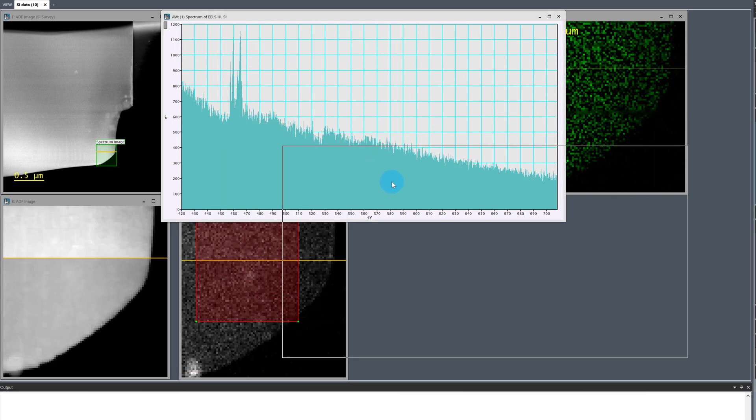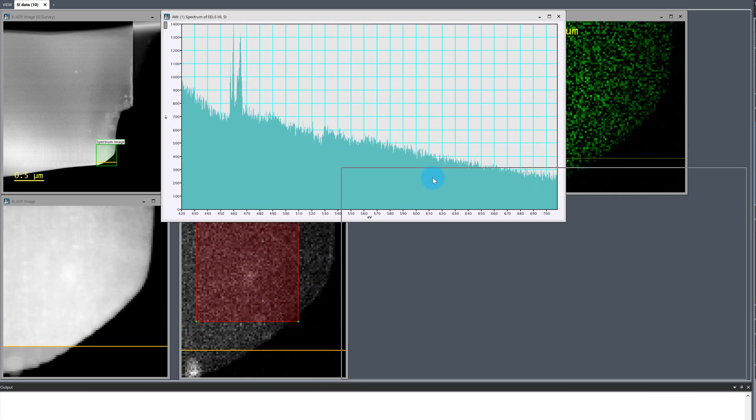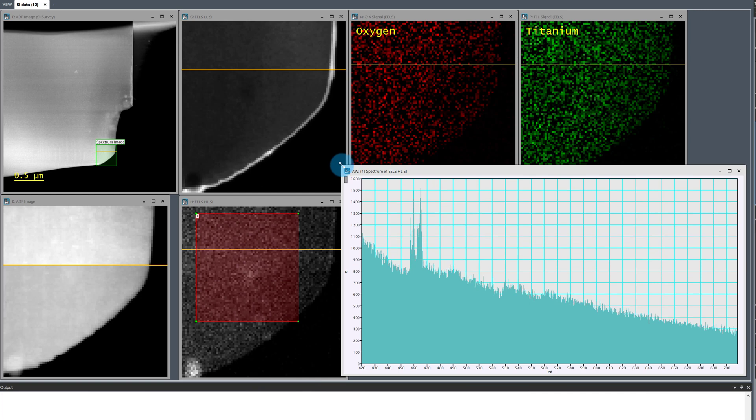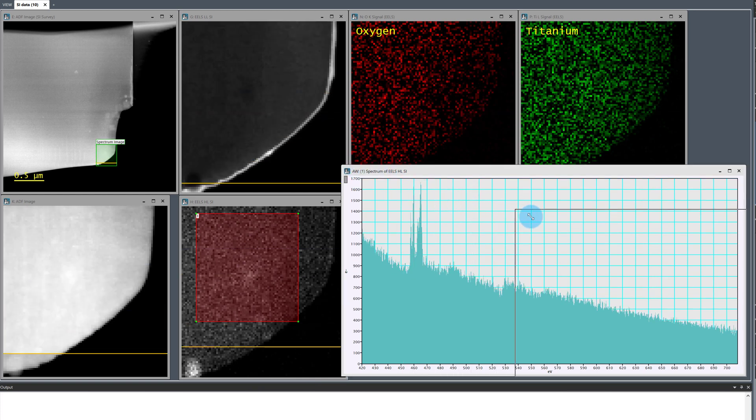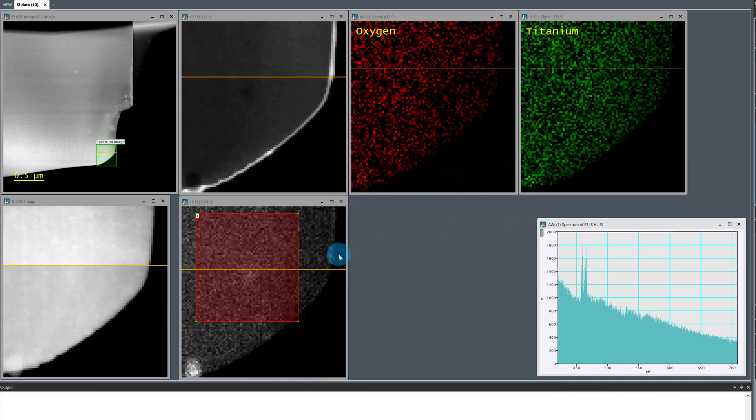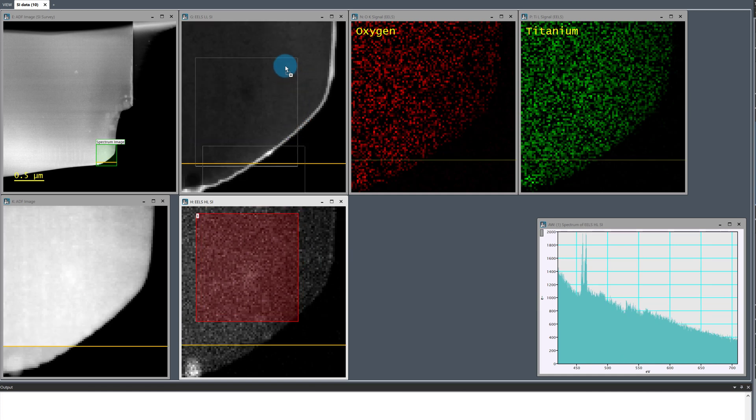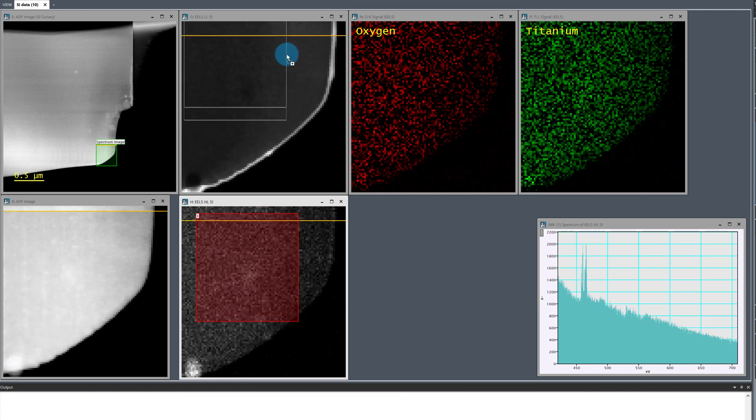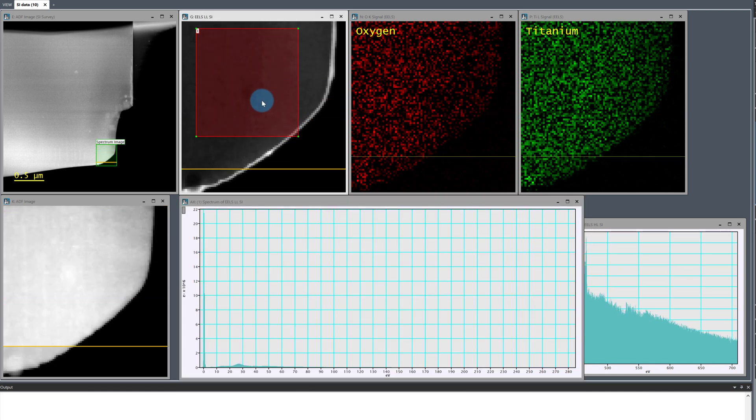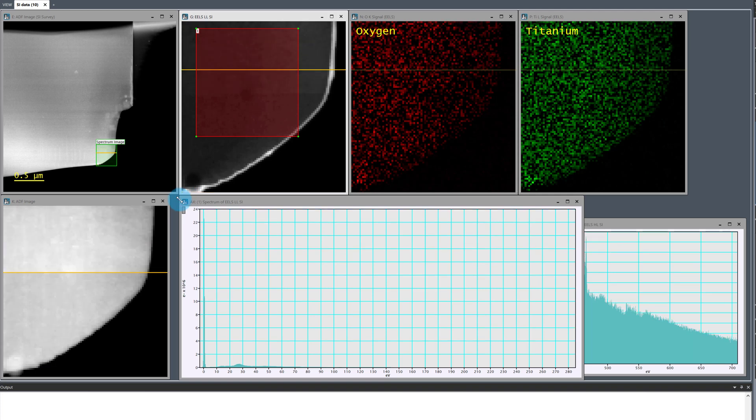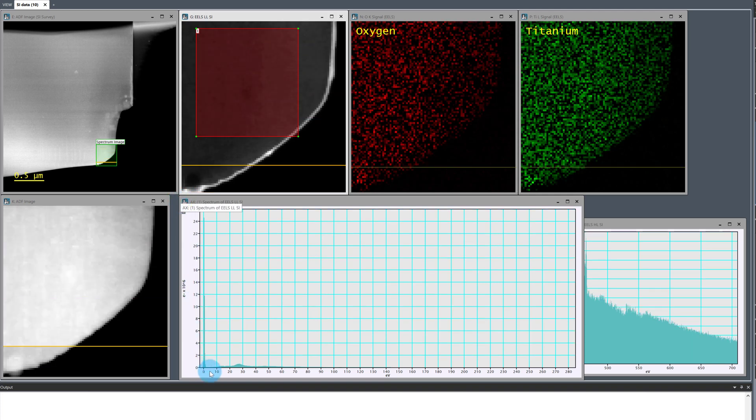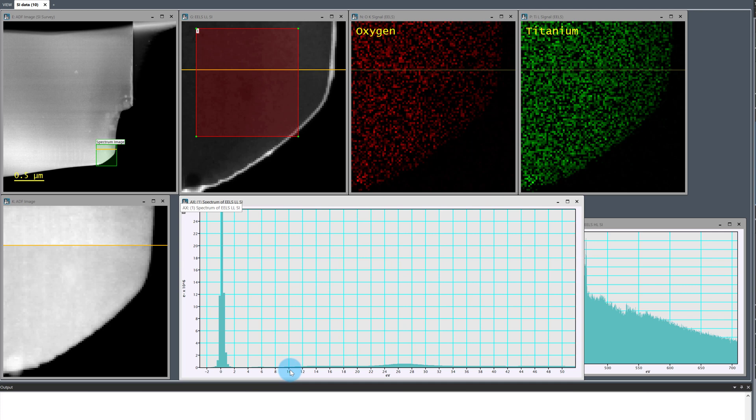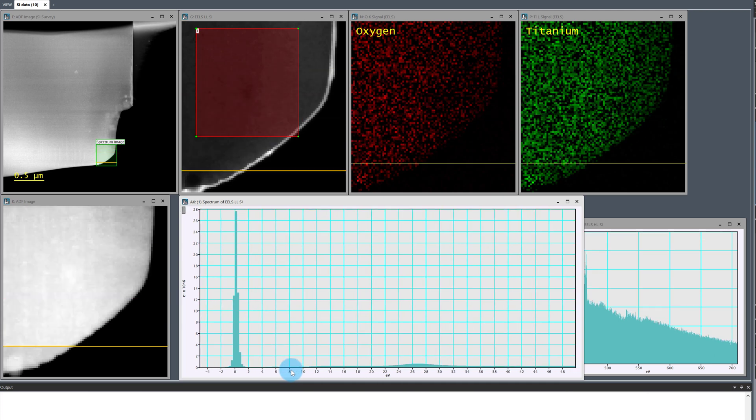I'll go ahead and use the spectrum picker tool to extract spectral data from the high loss spectrum image. I need to resize the window and rearrange a little and now I'll just drag and drop the same picker region onto the low loss spectrum image to mirror the ROI and extract low loss data from the exact same specimen region as the core loss data we just pulled out.